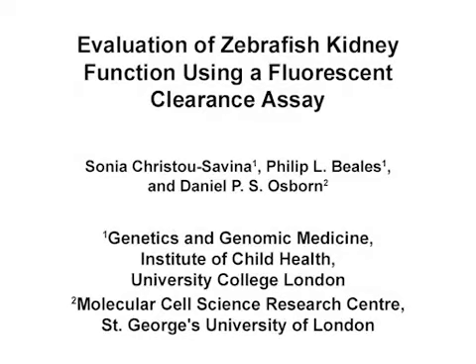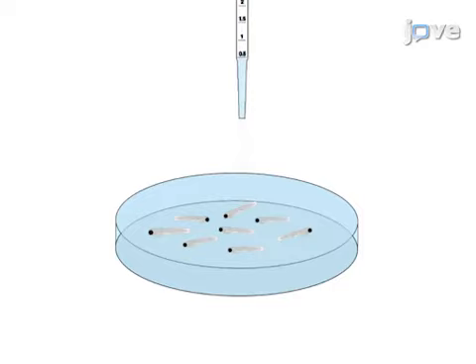The overall goal of this procedure is to generate a quantitative kidney function assay in zebrafish. This is accomplished by first anesthetizing zebrafish embryos at 72 HPF.